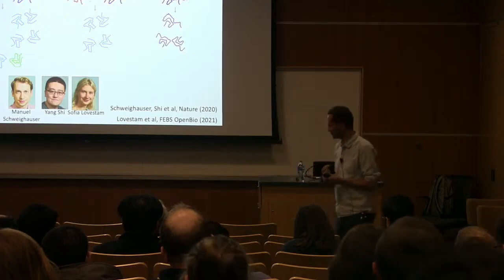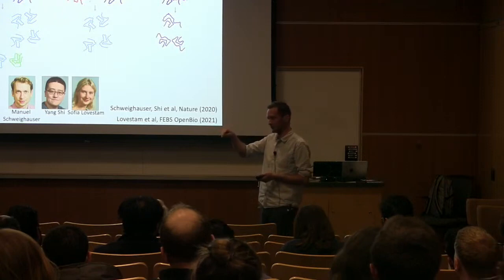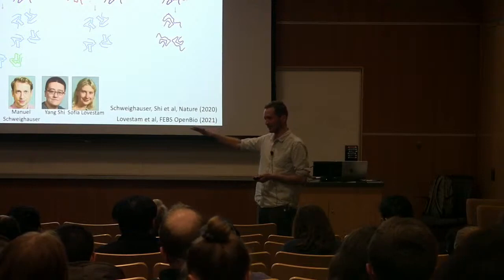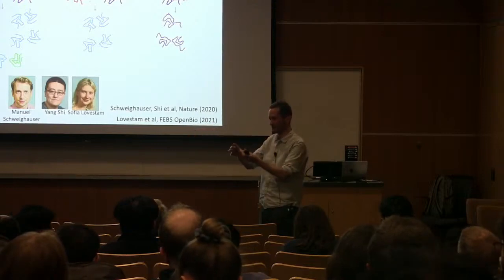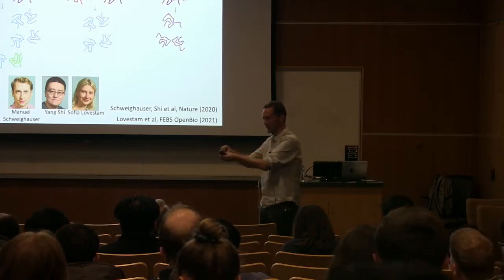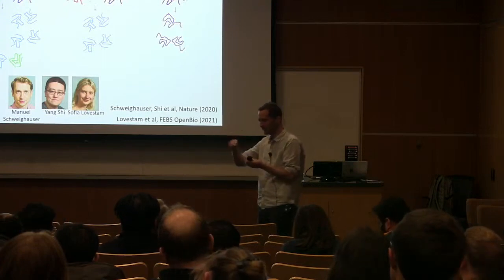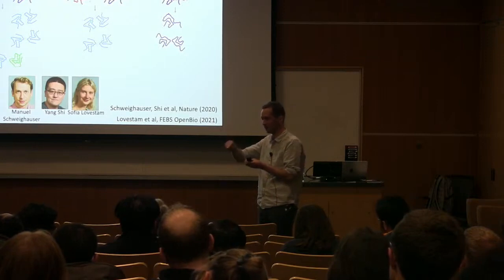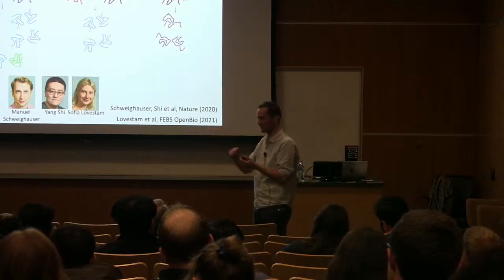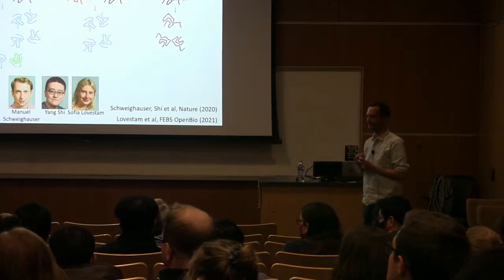So I think what Sophia did try was, she has the structures formed with salt and without salt. So she used those as seeds in the conditions of the contrary experiment. She used the salt-formed structures to seed aggregation without salt, and she used the non-salt-containing structures to seed aggregation with salt. And I think one of those experiments did replicate the same structures, but the other experiment did not replicate the structure of the seed, but replicated the structure of the condition. But I'm sorry, I forgot which way around it was. Yes, early days, yes. Okay, thank you very much.